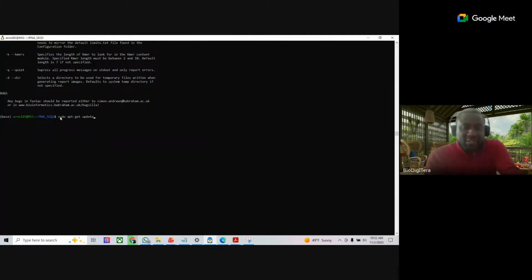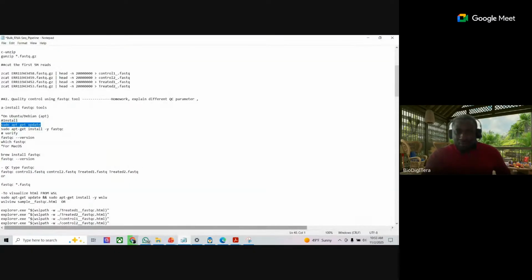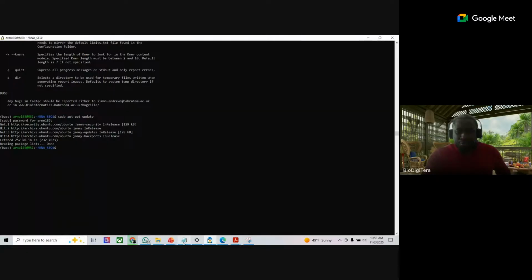If I type like this, don't forget, you will have to put a password because when you want to install, you will need the password. My password, I type it, enter. See, guys, I have it already. It is done. Now, next step, we check the version. Which version?